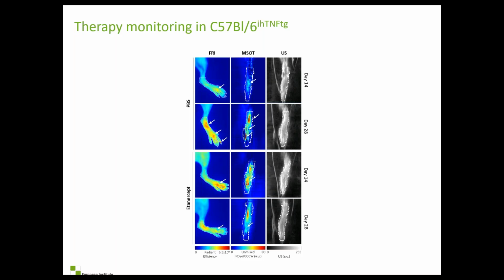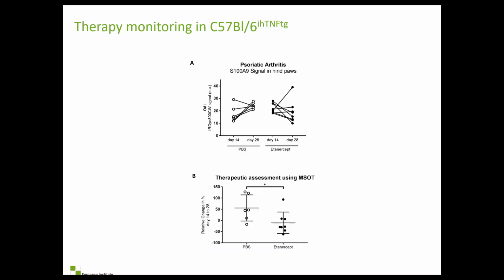At day 14, you can still see a high signal, which had decreased at day 28, where the spots were gone. The quantification showed the same.